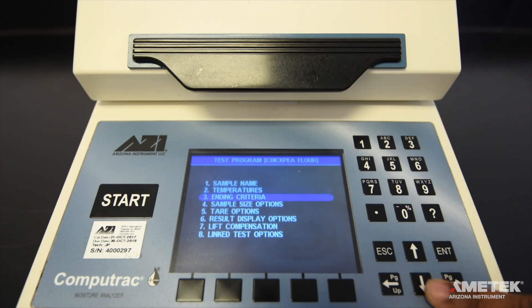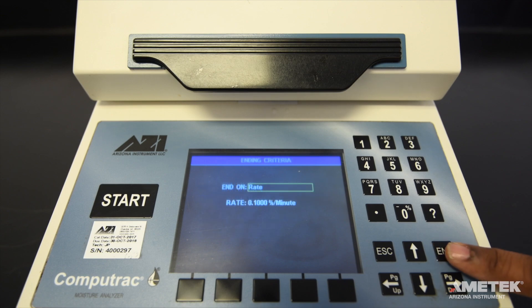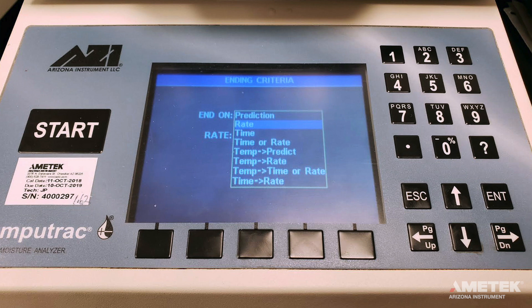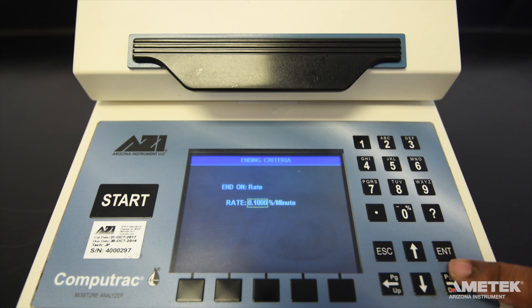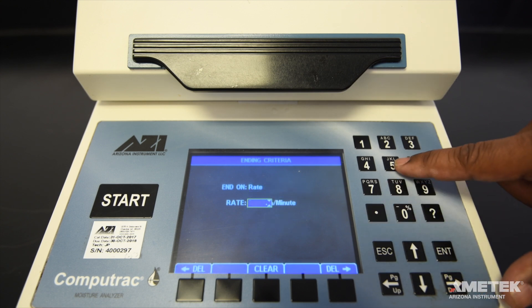Next, select ending criteria and press enter to begin editing. Options for ending criteria on the Max 4000 XL include prediction, rate, time, time or rate, temperature then prediction, temperature then rate, temperature then time or rate, and time then rate. The Max 4000 only allows for ending criteria of prediction or rate. Select the appropriate option and enter the parameter information in the second field.